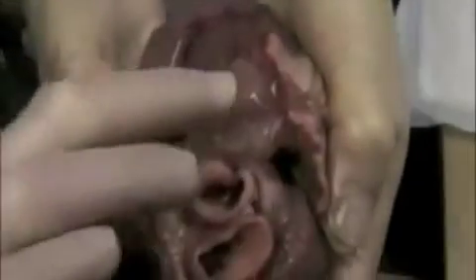Better examples when we get to the left-hand side. Don't forget, this is a relatively low-pressure chamber, the right ventricle. So there we have it. There's the down to the apex. Look how thick the septum is. It's a huge, big, massive chunk of muscle. So tricuspid valve, cords.